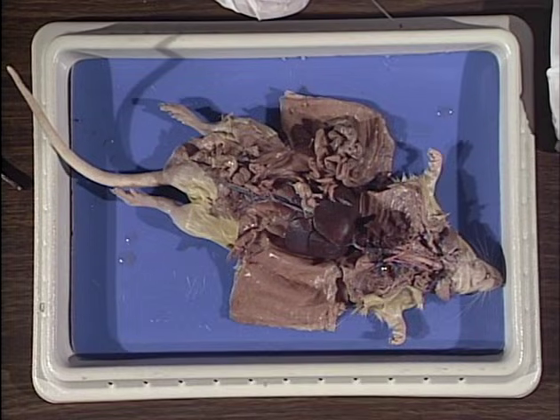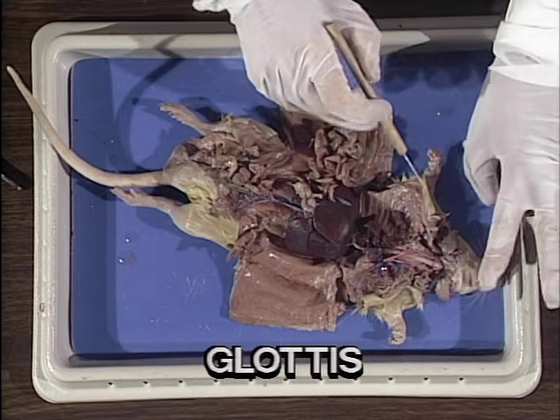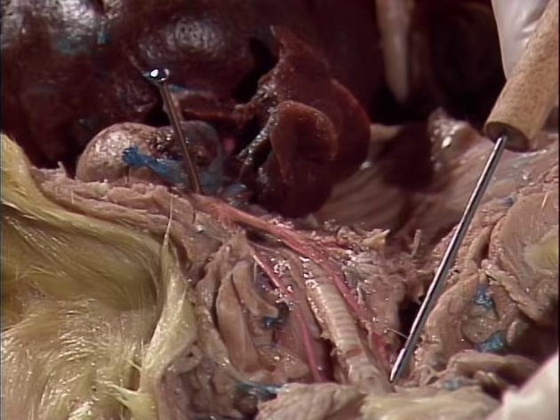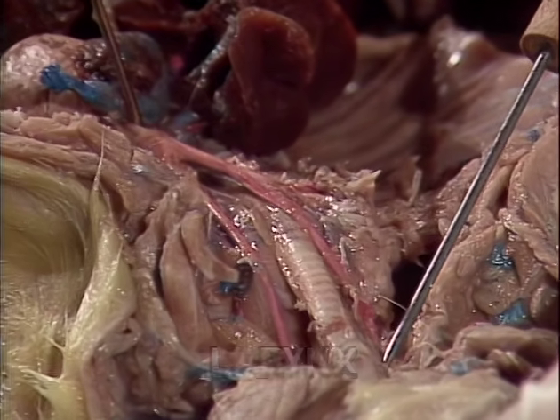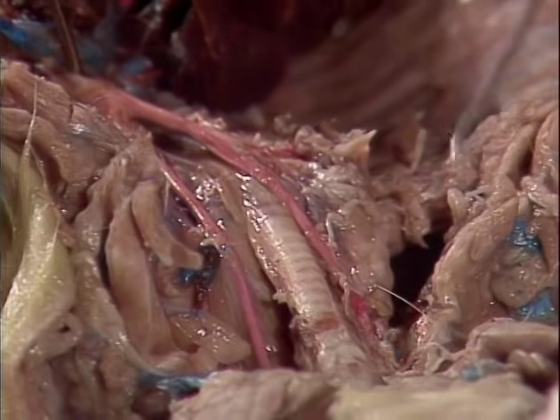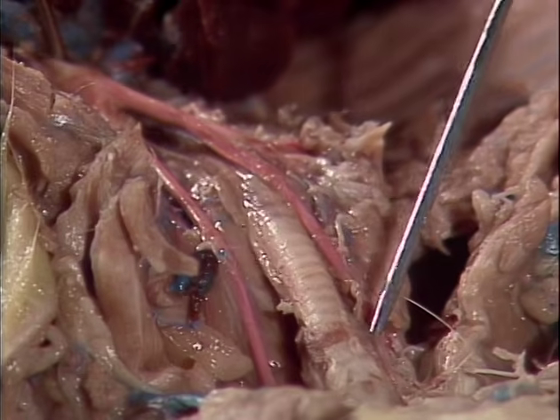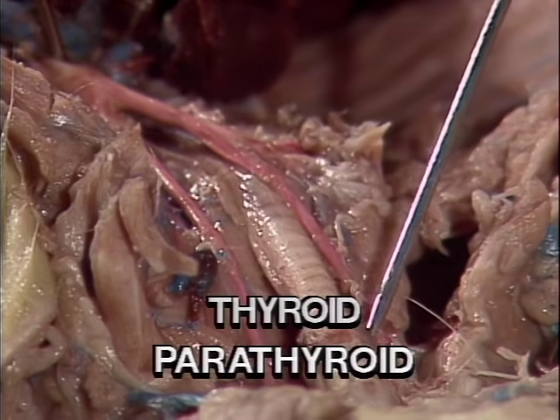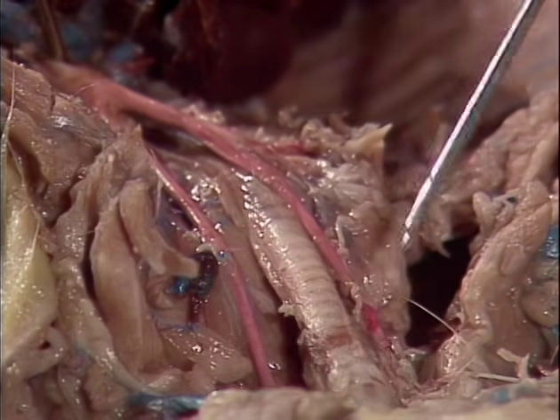Air enters the respiratory tract through the external nares. It'll pass through the glottis into this wide-shaped structure we see here, which is known as the larynx. The larynx is otherwise known as the vocal box. Lateral to the larynx are red-shaped structures known as the thyroid. Small parathyroid glands are embedded in the thyroid.